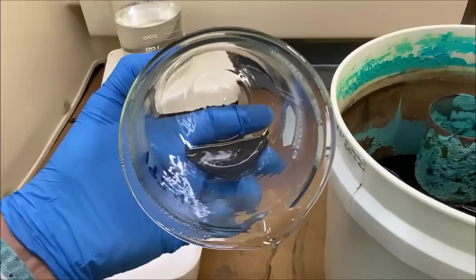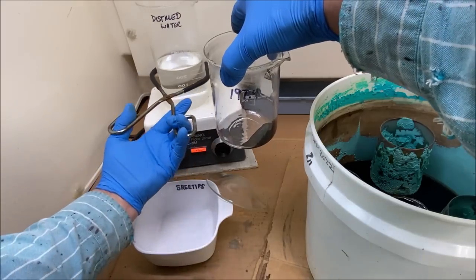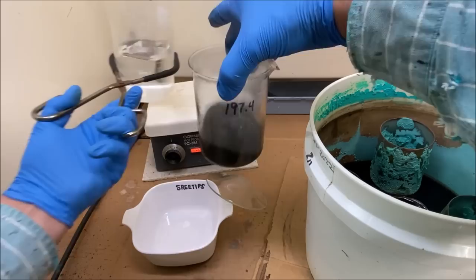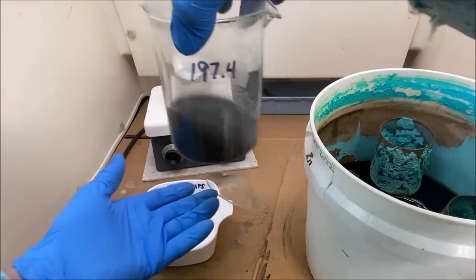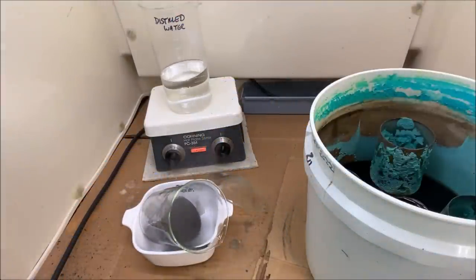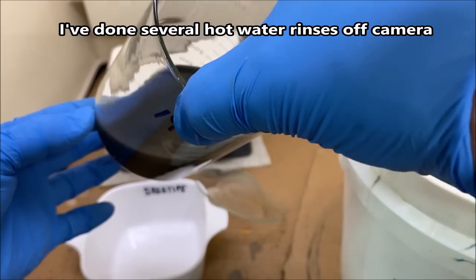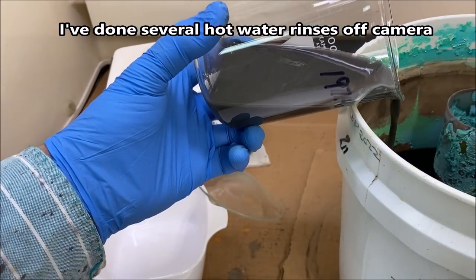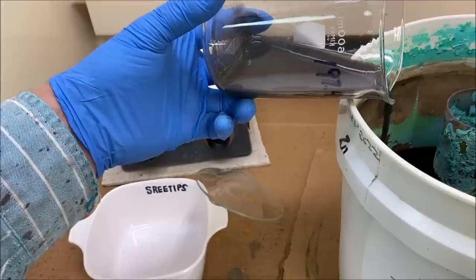And I think what we'll do now is rinse it a couple times with some hot water. Boy, it loves to suspend. So we're going to set this down and let this settle out for us. Here we go. Here's our last hot water rinse. And we've got the dreaded black ink suspension. That means we're getting pretty close to having this material cleaned up.